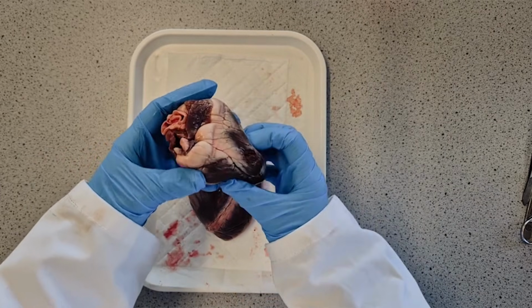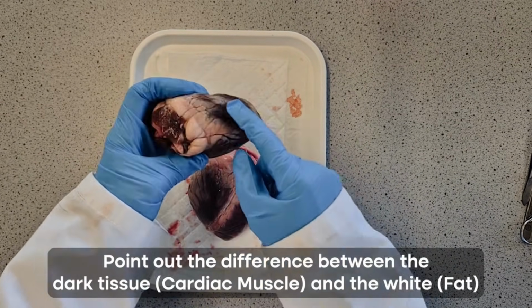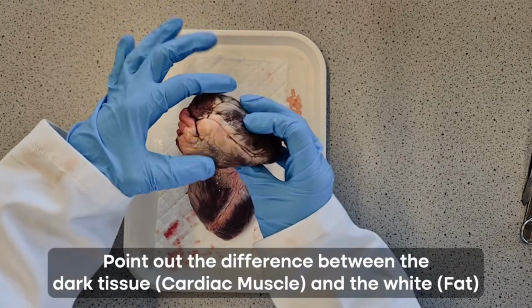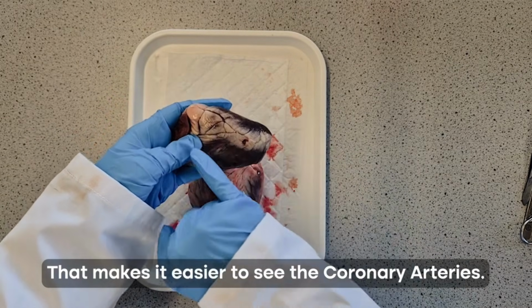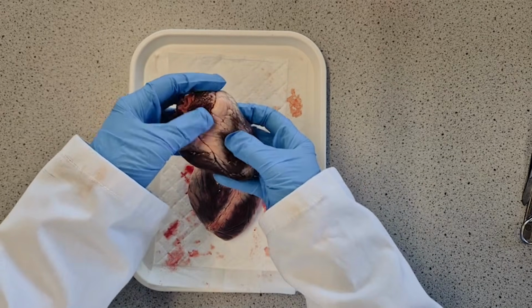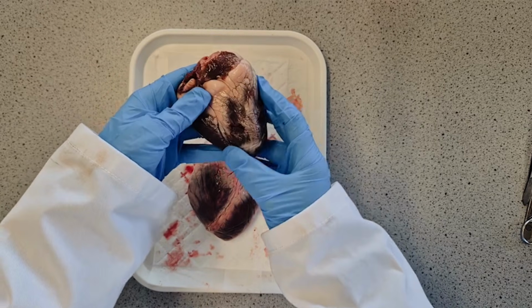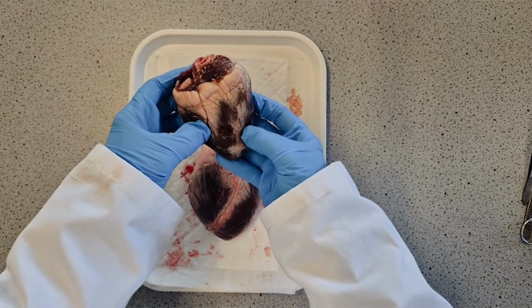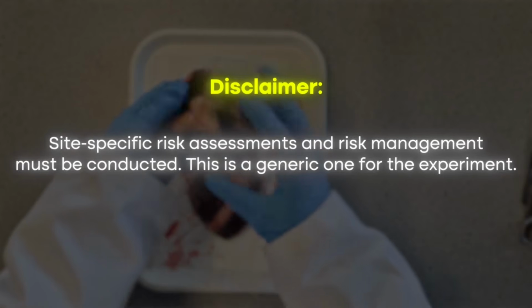So if we have a look, we can see first of all on the outside, I'd point out the difference between the dark tissue here, which is the cardiac muscle, and the white, which is actually fat on the outside of the heart. But that makes it easier to see the coronary arteries, where we can see them running along these line-like structures, and those are the blood vessels that provide the cardiac muscle with oxygenated blood so that they can respire aerobically so the heart can contract and relax. And if one of those gets blocked, that's when you don't get the oxygenated blood to the heart, muscles can't contract and relax, and you can have a heart attack.